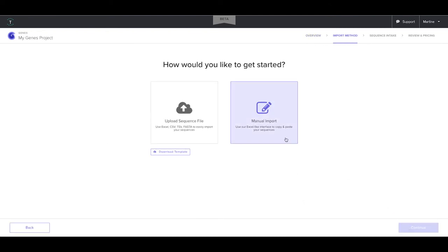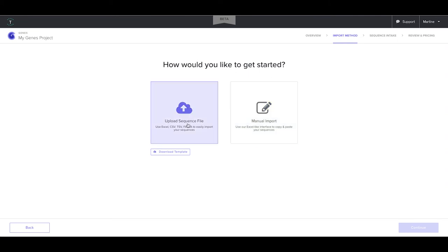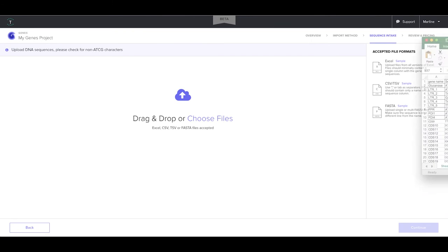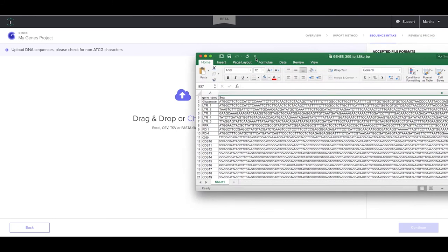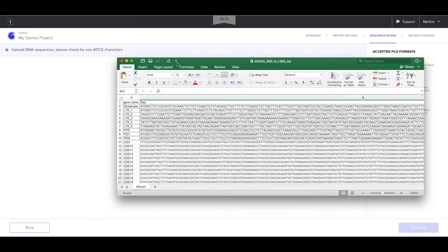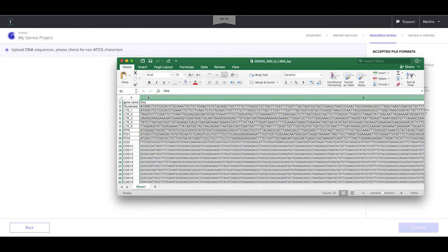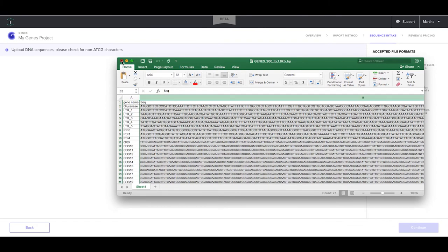In the next step, you can either manually import your sequences by pasting them into a genes grid, or you can upload a sequence file. Here is an example Excel file which contains a gene name column and a sequence column. Let's now proceed to import this file.